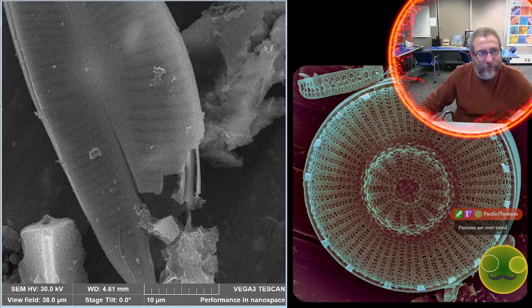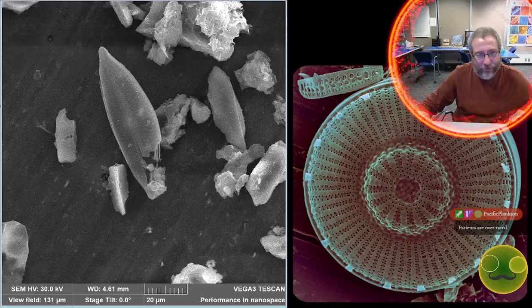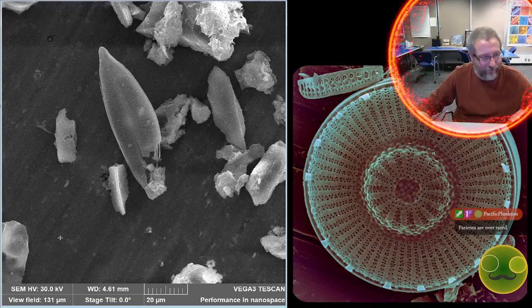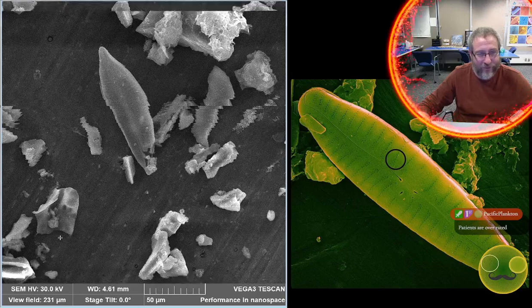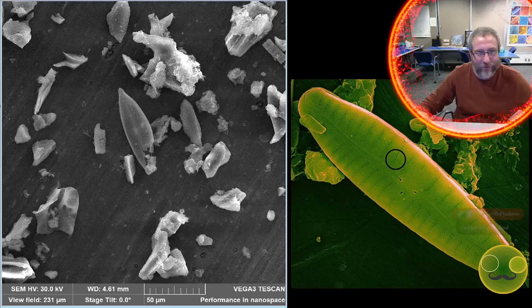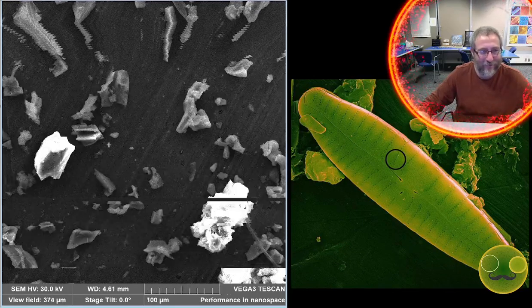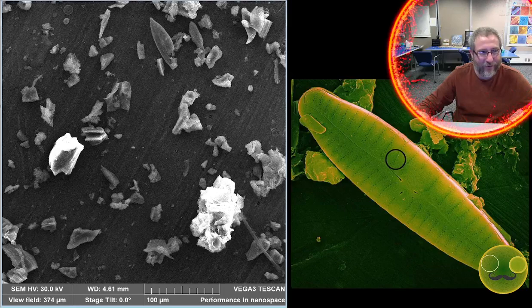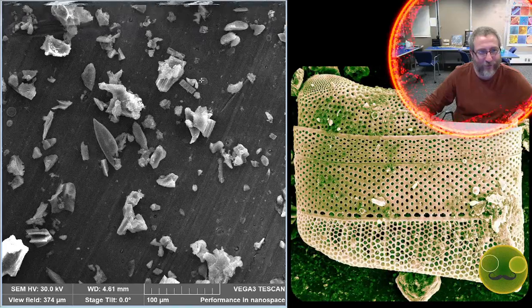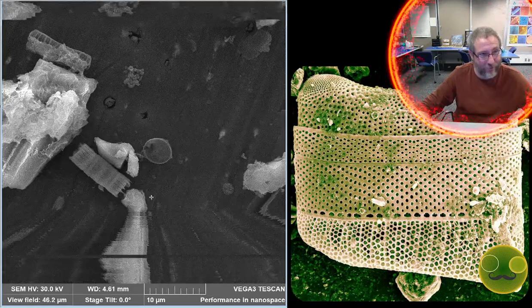This is a diatom, obviously. This is a raphid diatom, so it doesn't have many of the structures of the things that we've been talking about. And just for reference, all this stuff that we're looking at is volcanic ash. All these chunks of things that aren't diatoms are what tephra looks like in the scanning electron microscope. It's diatoms and tephra, and that's what we're seeing here. So everything that you're seeing is one of those two things right now. And the guys that collected this stuff were convinced that it was all just pure diatomite, and I was like, it's mostly tephra. Most of the stuff that you sent me is just volcanic ash. It's sometimes difficult to tell what you're looking at in hand sample between the two.